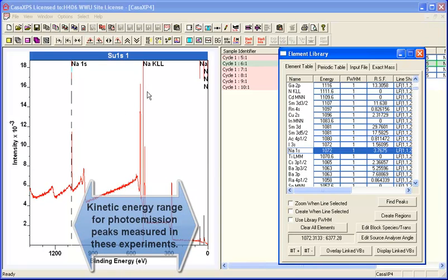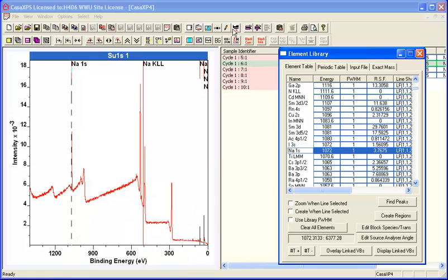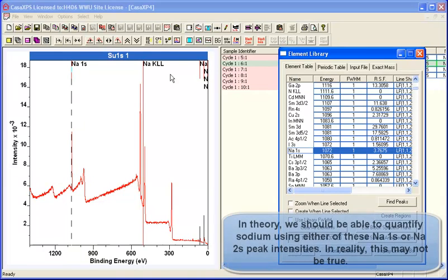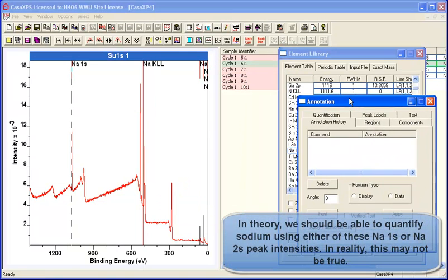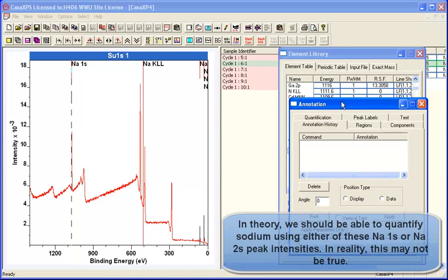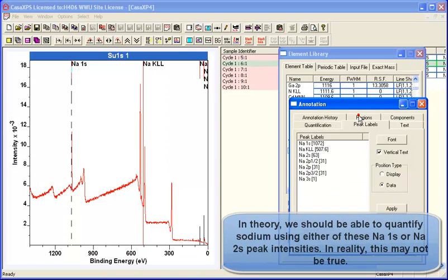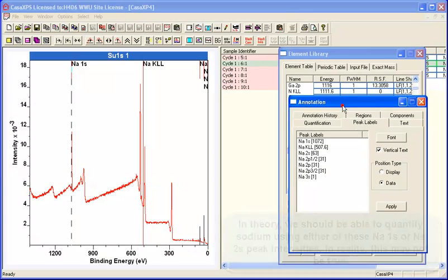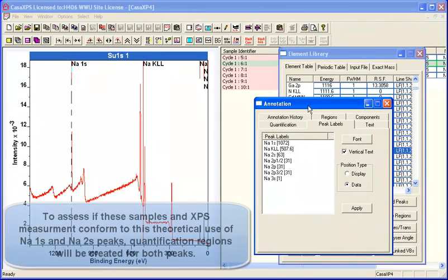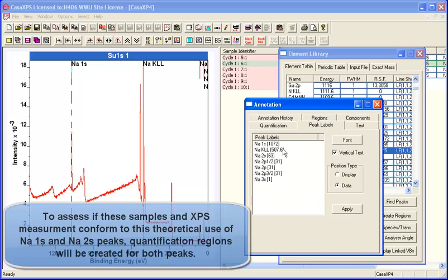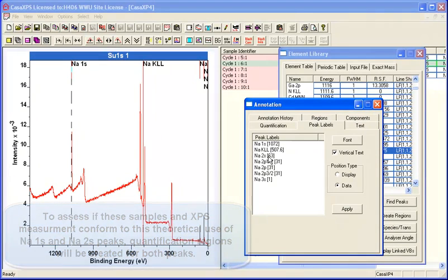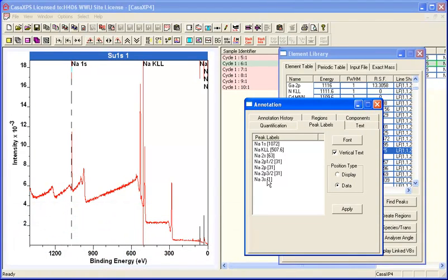The next thing we might want to do is create some regions and make sure these sodium peaks are properly calibrated in terms of intensity. Let's bring up the annotation dialog window. We'll illustrate a feature here that relies on the element library. You can see the peak labels.